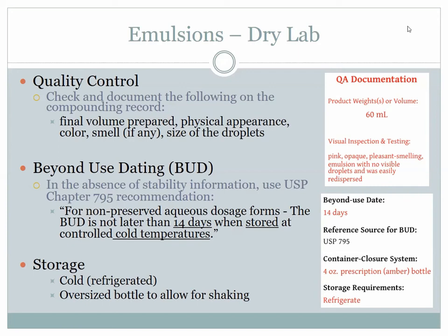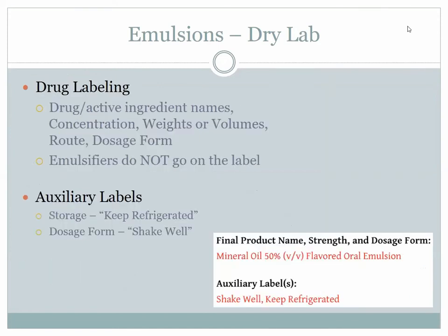So under storage, that goes together. Our 14 days from today, and we would put it in a refrigerator and then an oversized bottle, because just like suspensions, you need room to shake it up really well each time. So there you have it. That's kind of the information on that.